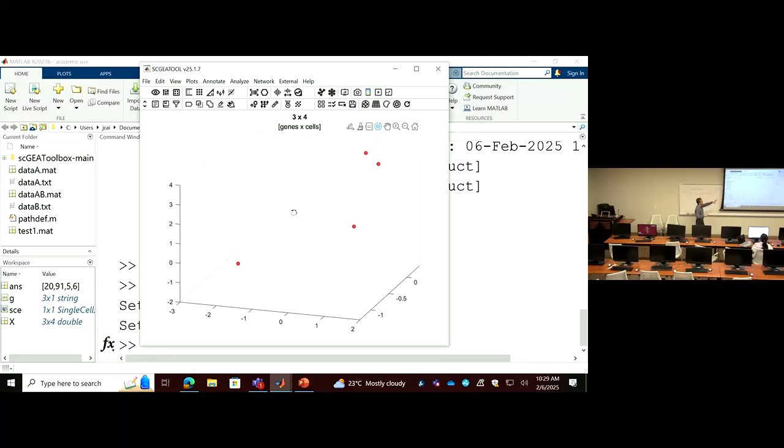Now we are going to stop using this for a while and go back to the command line, so we can treat each cell as a vector or data point and see how we can apply the knowledge from the lecture to calculate the distance between cells, using a 3D small example.